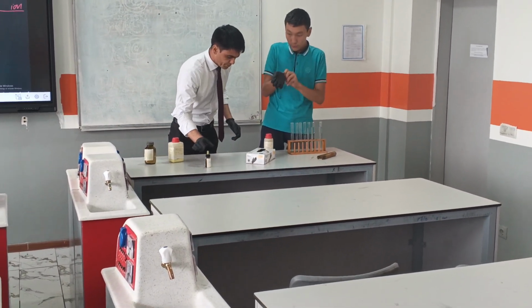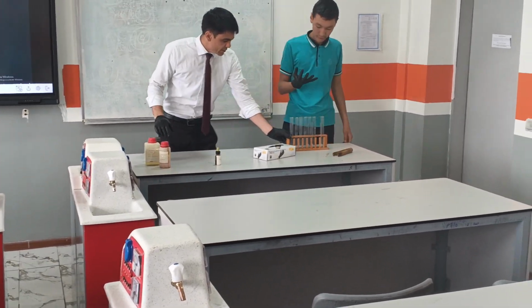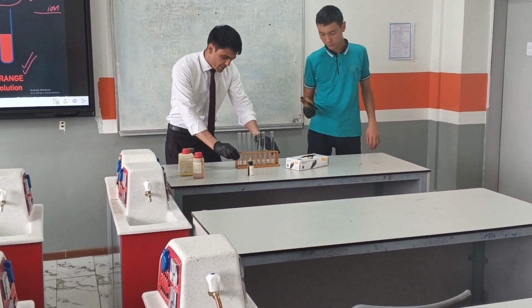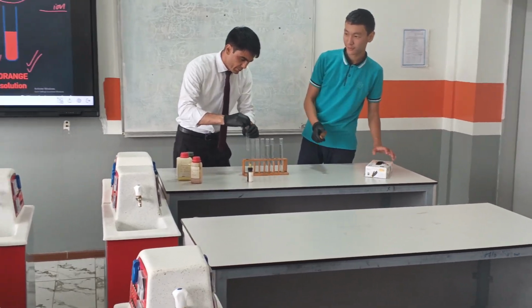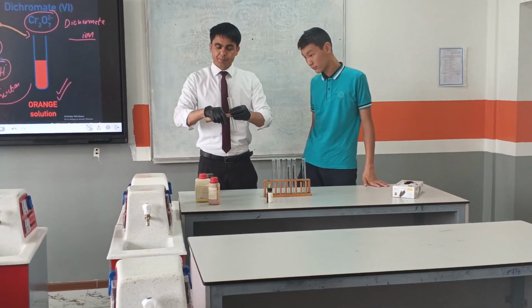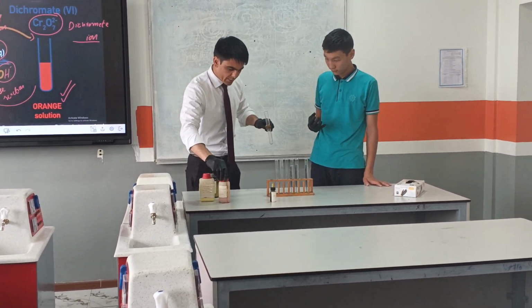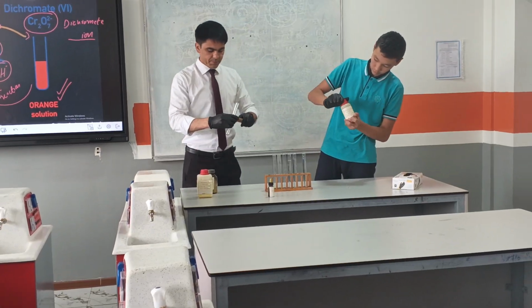Okay, so now let's prepare the solutions. First one. We can use a stand holder, like this. Now open this bottle.